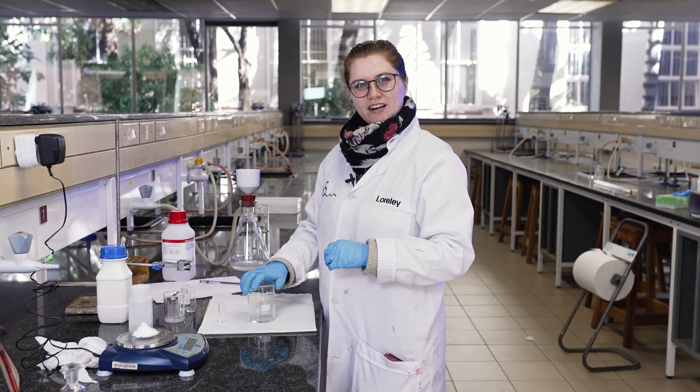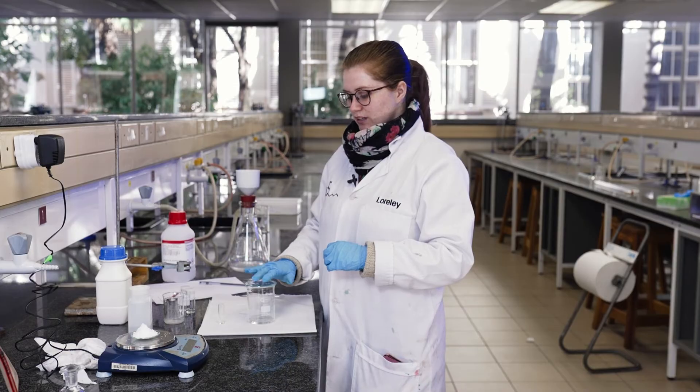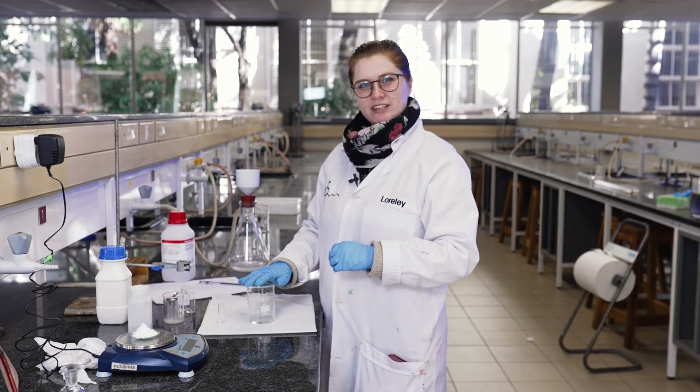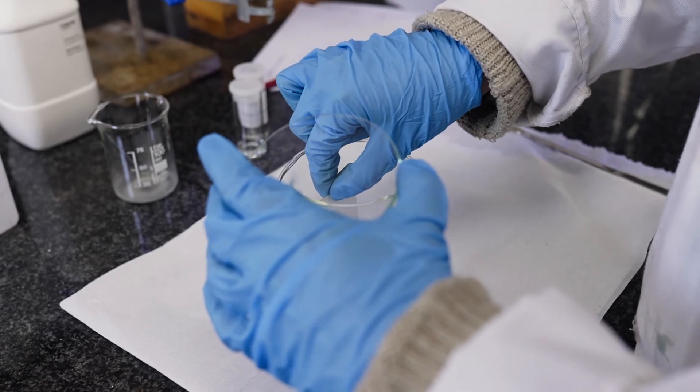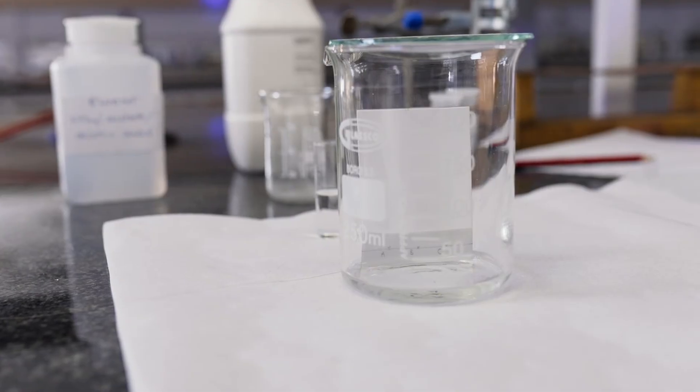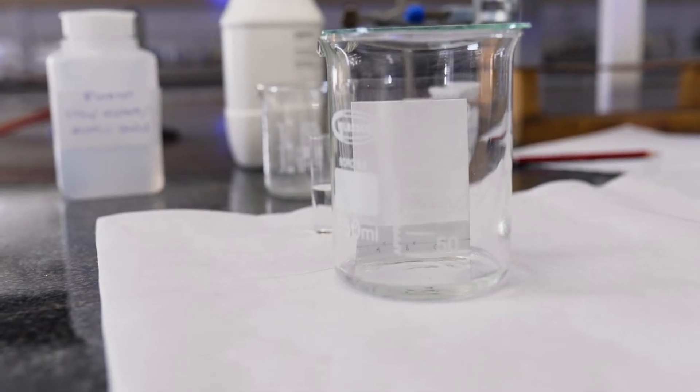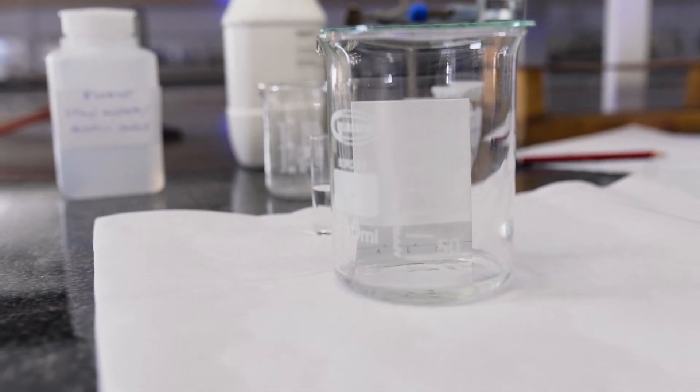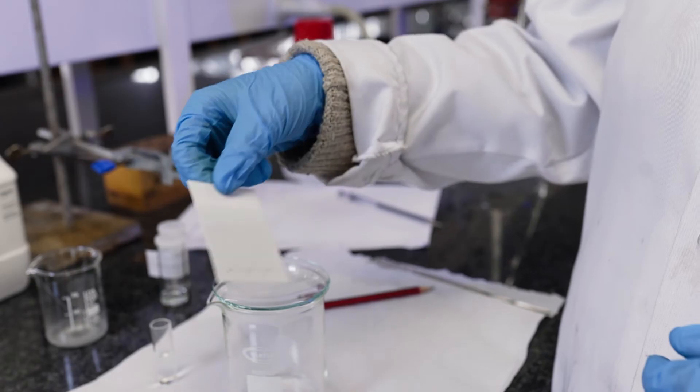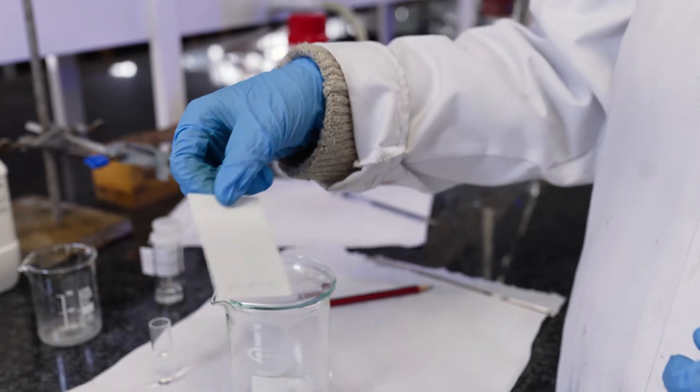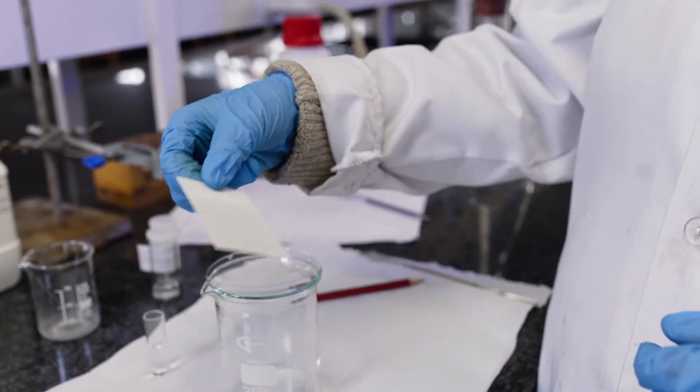So now we need to start running our TLC plate, but before we can do that we need to make sure that the beaker with our eluent is fully saturated. Okay, so now we need to make sure that the TLC plate is dry before we have a look at it under the UV light again.